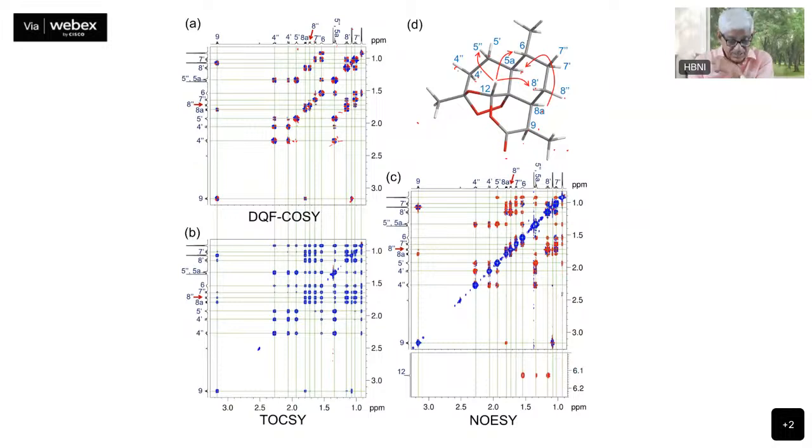Okay. So let's do the same thing for the 4 prime. Now if you look at the 4 prime, it was showing you two peaks there. We show one peak here, this is the 4 double prime you're looking at. 4 double prime was showing a peak to 4 prime and also to this 5 prime there. Now you are seeing more here. You are seeing to the 4 prime as before. You are seeing to the 5 prime. You are also seeing to this one there.